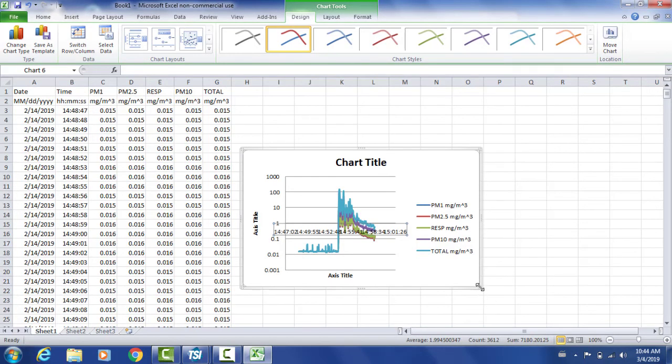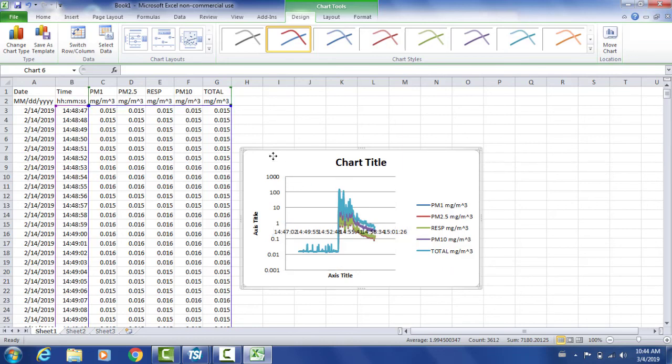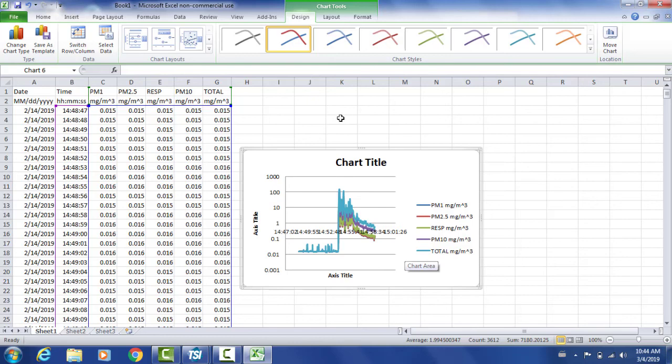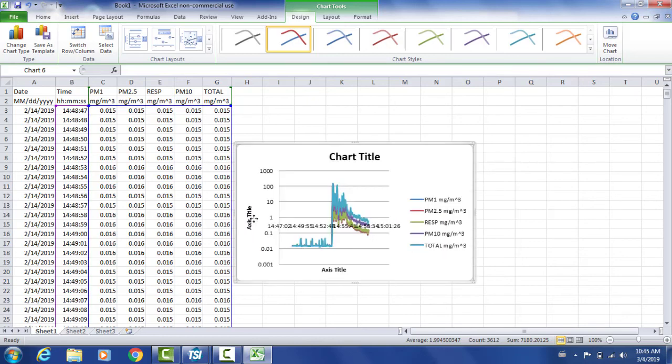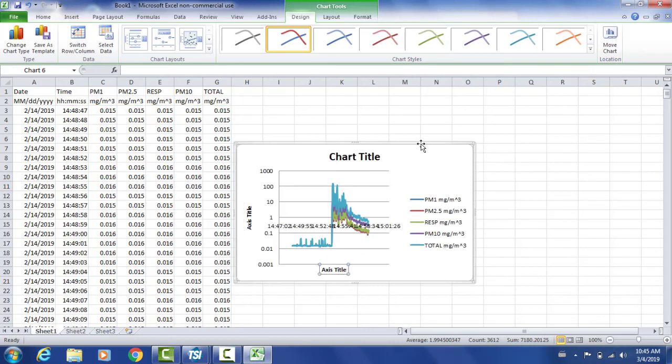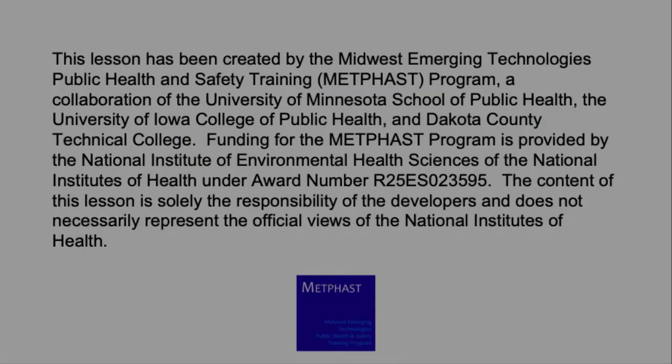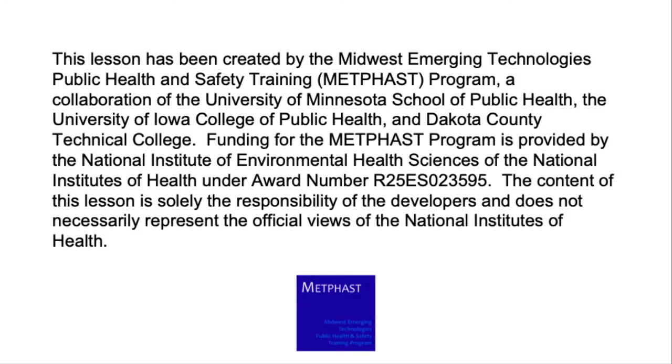Once you have your chart and your graph on Excel, you can now go ahead and edit it as you wish. You can change your chart title, your axis labels. You can also go ahead and maybe delete one of the mass concentration fractions if you just want to visualize one. So there are different options to do once the data is on Excel. And that is how you export your data into an Excel spreadsheet.